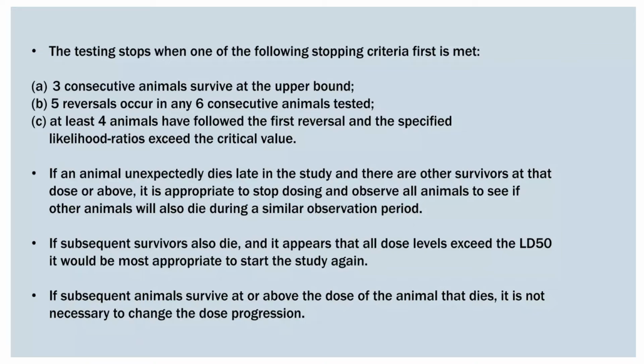If subsequent animals survive also die, and it appears that all dose levels exceeded the LD50, it would be most appropriate to start the study again. Yeah, this is a crucial point we have to see. We have to rethink and we have to conduct the experiment again.